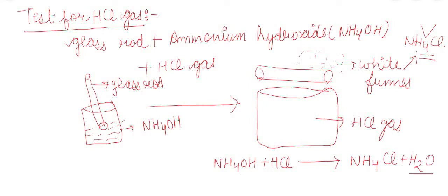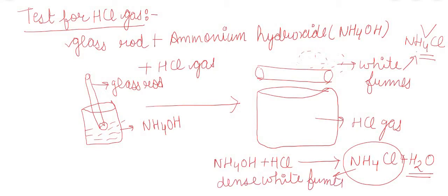That water molecule is not necessary here, but this ammonium chloride will provide you dense white fumes, and those dense white fumes indicate that HCl gas is present here.